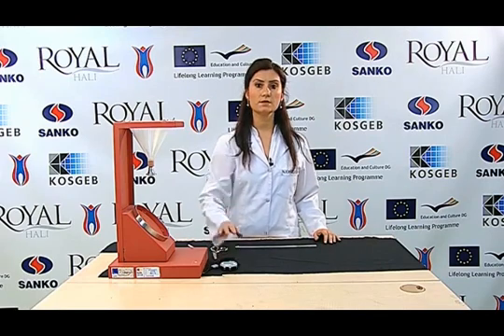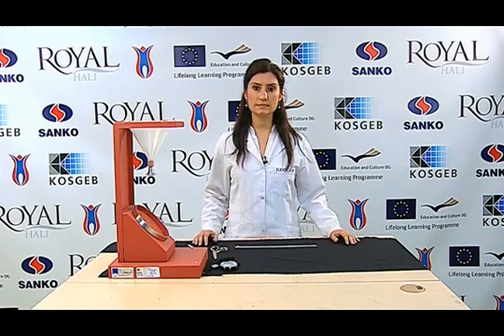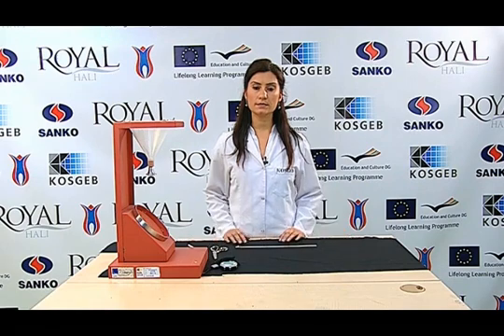In this test, we use a spray test device, a stopwatch, pure water, and a photographic scaler.